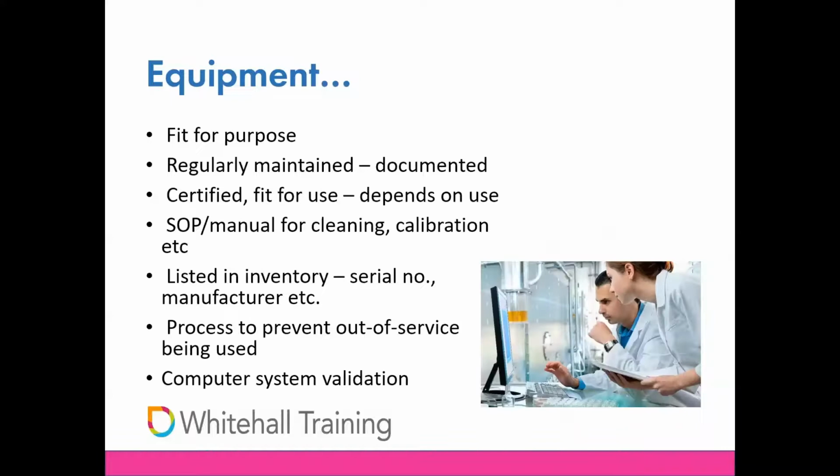So let's look at the equipment. It sounds obvious, but it needs to be fit for purpose. It should be regularly maintained by someone who's suitably qualified to do it, and the maintenance needs to be documented. Now, before equipment can be used on clinical studies, and again, I'll keep saying things that need to be in place before you actually start any clinical trial work, it needs to be certified as fit for use.